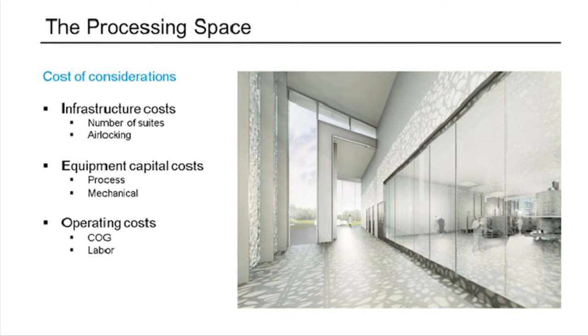your facility throughput. So when we talk about large-scale allogeneic processing, that's a lot less emphasis on labor because it's essentially one or two batches that you're doing that will have a couple people involved, whereas if you are talking autologous cell therapy, patient-specific scale, where you need one or two operators per patient line, that's a lot more people involved if you're trying to treat 1,000 or 2,000 patients a year. So a much heavier labor investment there.